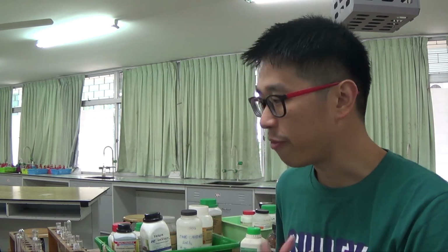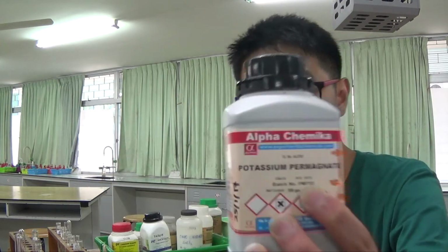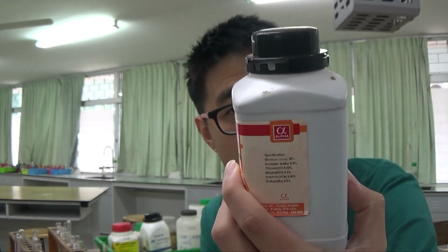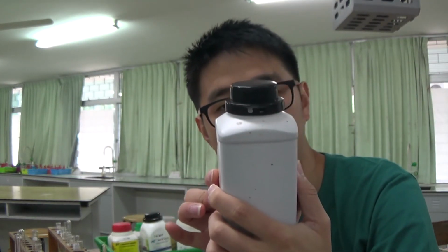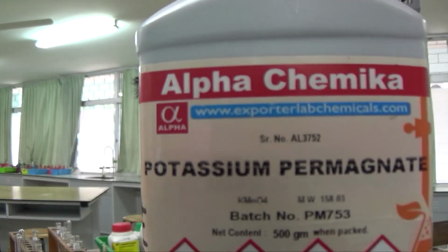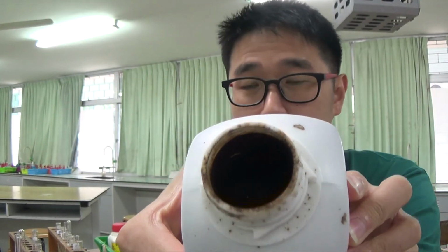So all of you should be familiar with something called potassium manganate 7, meaning VII. Potassium permanganate 7 is the same as potassium manganate 7. This spelling is a bit weird. It should be potassium permanganate 7, and this has the formula of KMnO4, there on top with the molecular mass, or the Mr. Okay, so it's this purple color solution, but it looks really dark, kind of blackish.